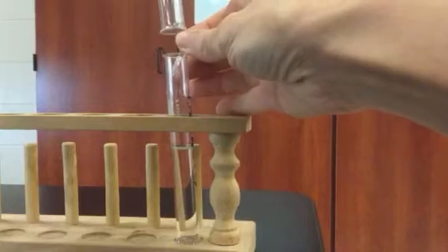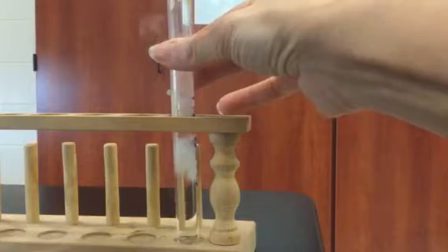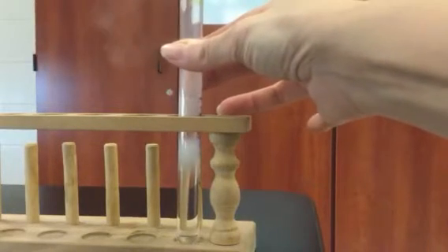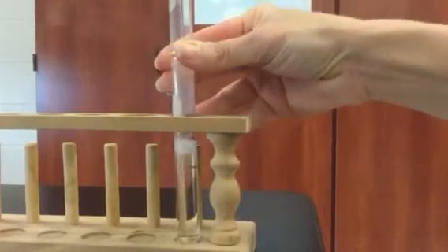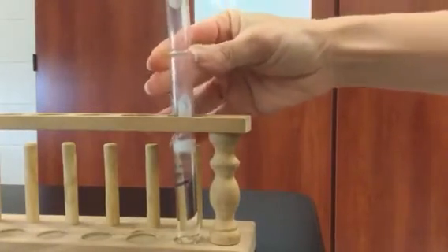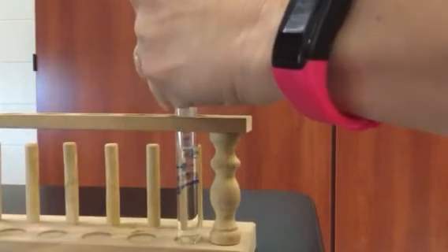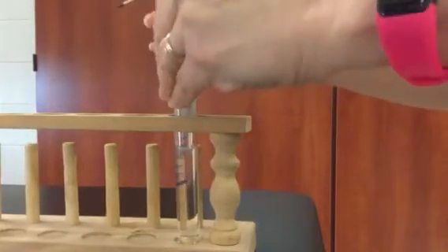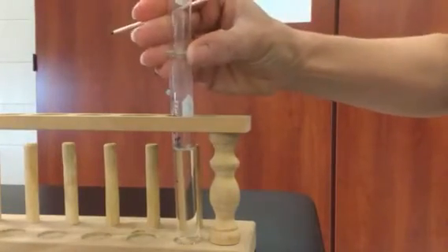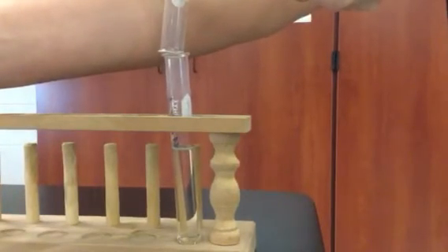Let's see if I can get this out and around. I planned this a little poorly. There we go. Now, I'm going to light a splint on fire this time — not just glowing, but we're going to leave it burning.